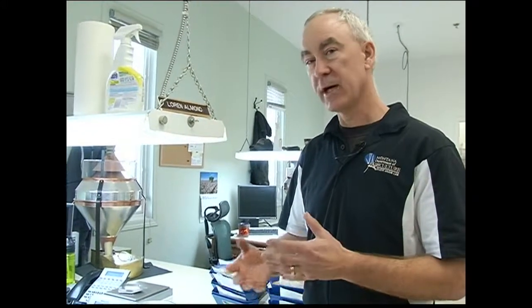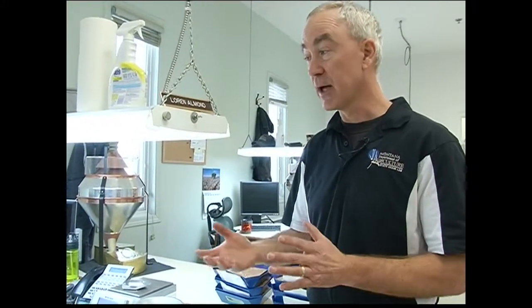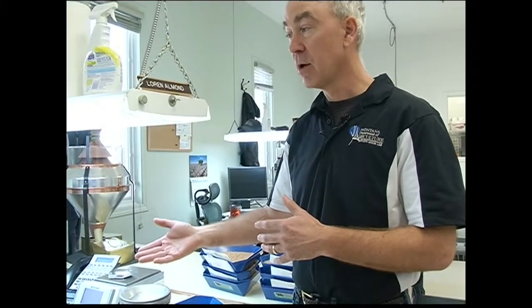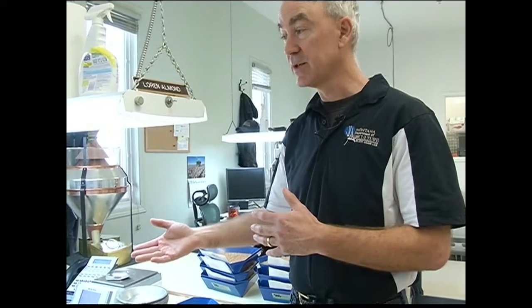This year, we had challenges during harvest because we had untimely rains. And those rain events essentially bleach out the kernel. So instead of being dark, hard, and vitreous, it's soft. So as a grain inspector, they're going to go through a spring wheat sample or a durum sample and determine the percentage of kernels that are hard versus those that are soft.